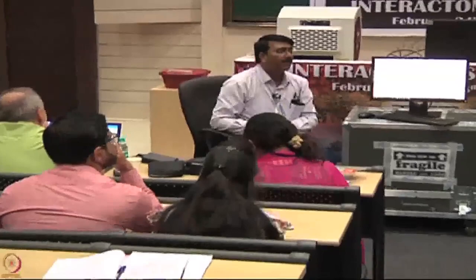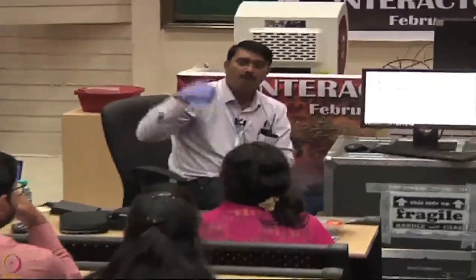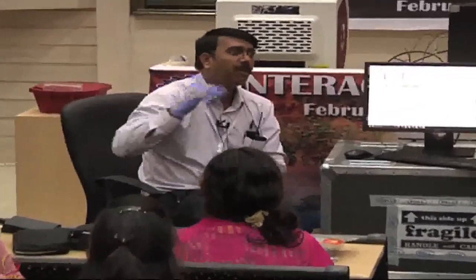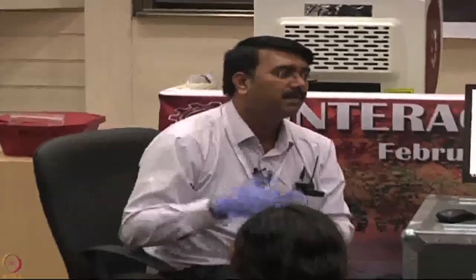One thing we have to consider when doing the regeneration is the stability of your ligand. Whatever you had immobilized on the sensor surface should be stable after the regeneration. Sometimes, if you are using conditions like glycine or a higher basic pH, your protein probably undergoes denaturation. Then for the next experiment, we can't use the sensor again. So that's why we have to carefully consider the regeneration solutions.